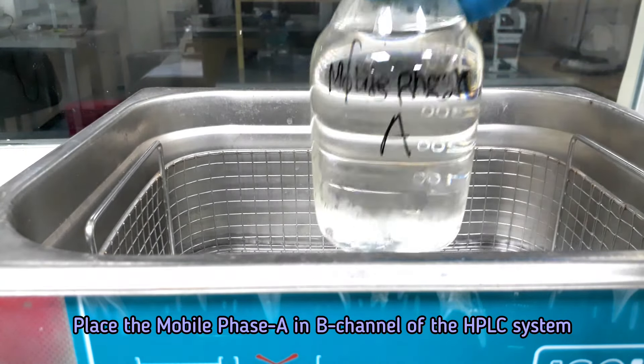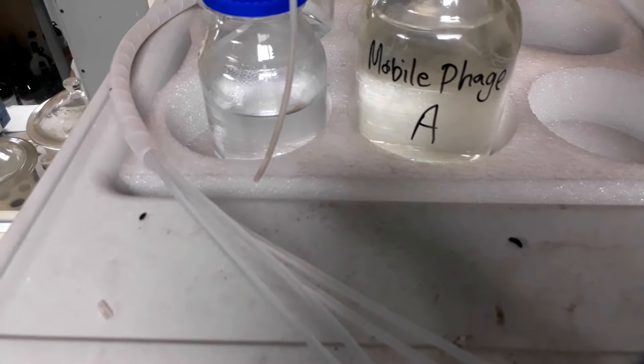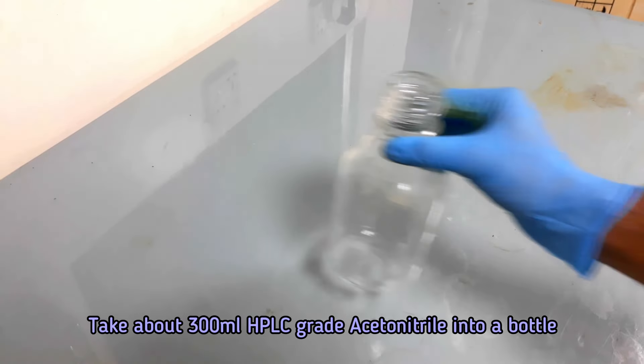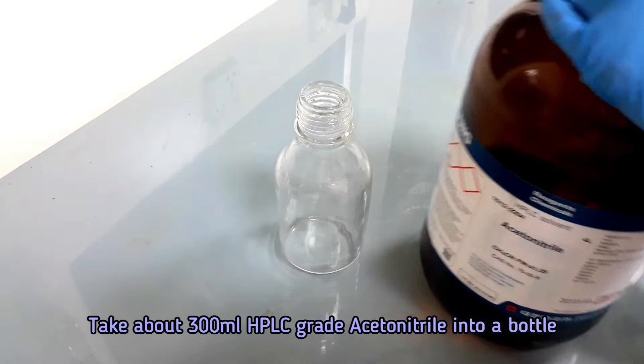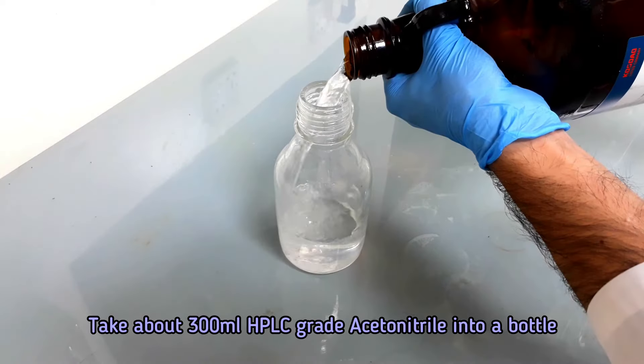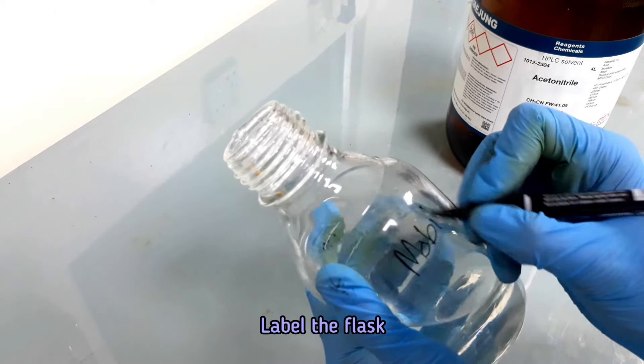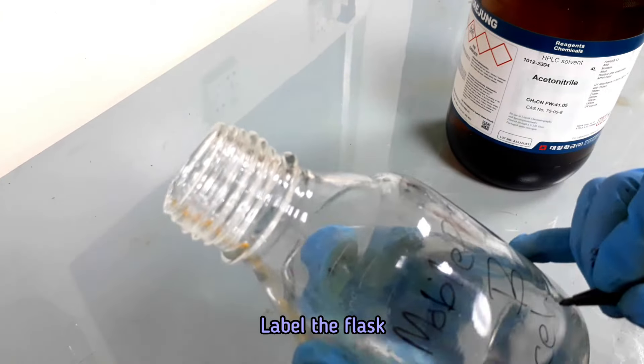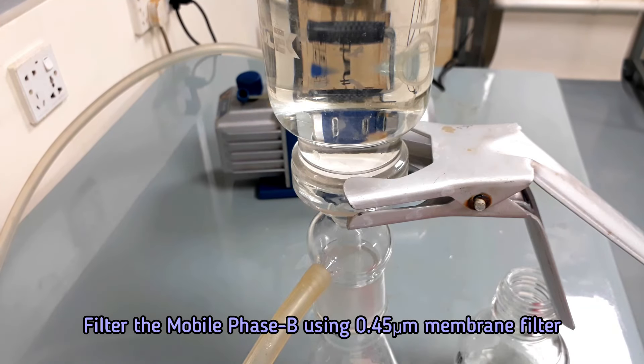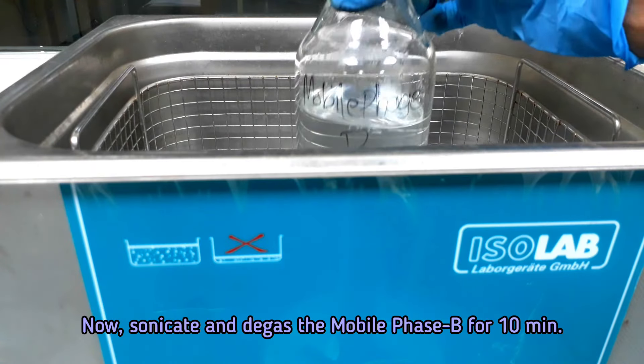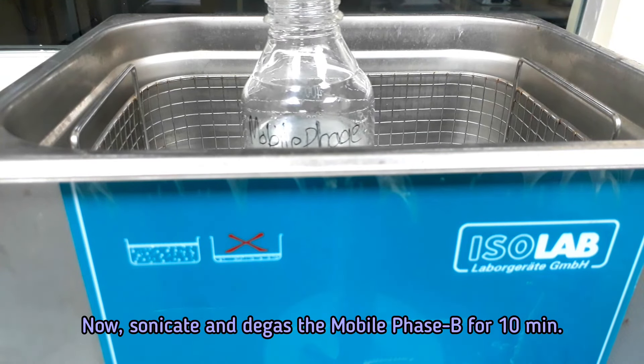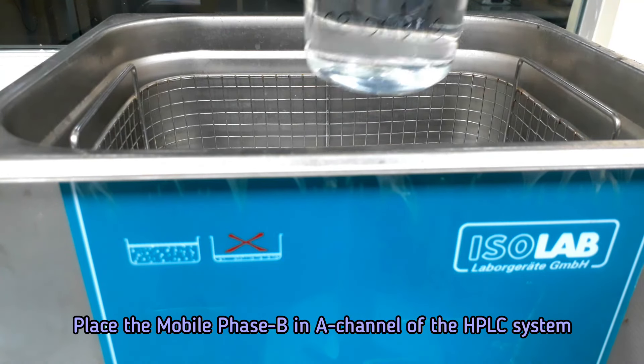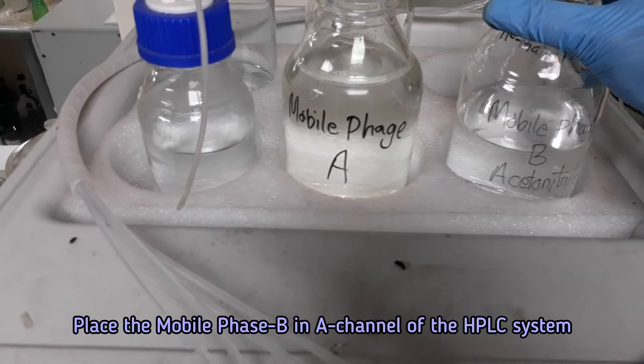Now, we will prepare mobile phase B. Take about 300 ml HPLC grade acetonitrile into a bottle. Now, filter and sonicate as done previously for mobile phase A preparation. Keep the mobile phase B in the A channel of the HPLC system.